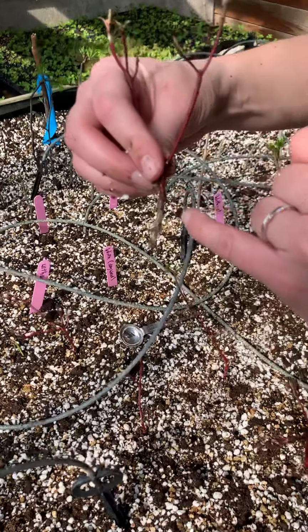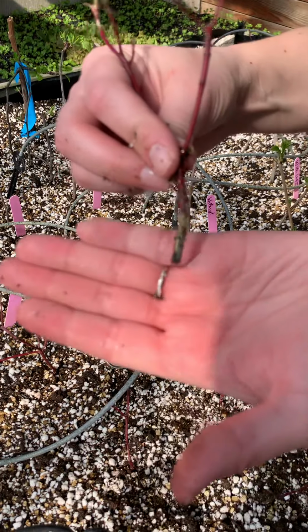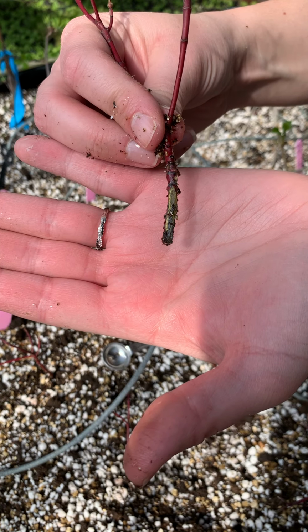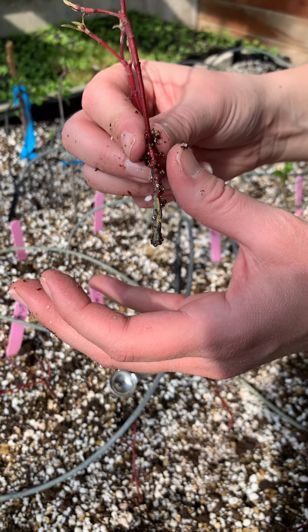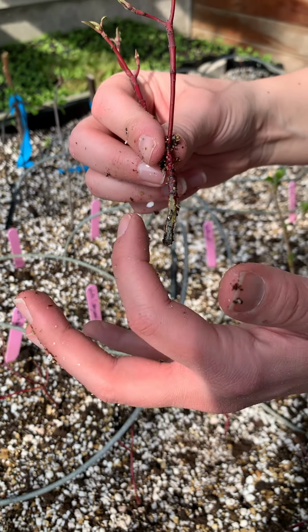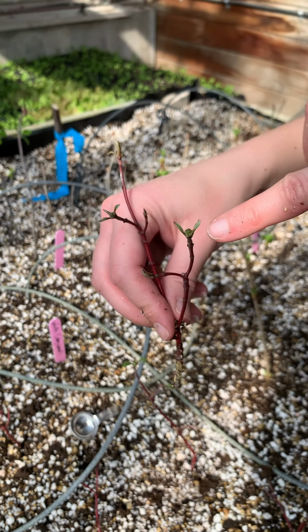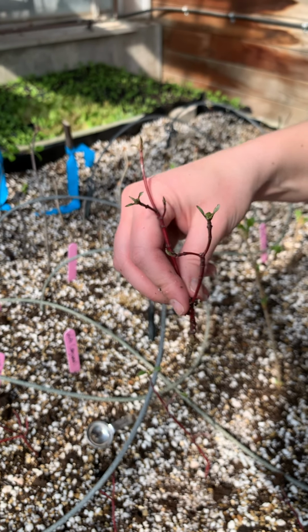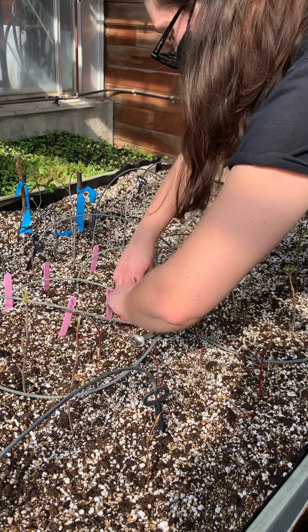Here we've got the callus again. You can see it's really, really dramatic. Let's see if we can get it to focus. Just that white, nice light wood around the outside of the wound. And I thought we had the same sort of deal with roots just starting, but those pieces all come off. So definitely have C and definitely have F, because we can see again the foliage and those cute little flowers starting. So dogwood number 3 with rooting hormone would get a code of, is it FC or CF?